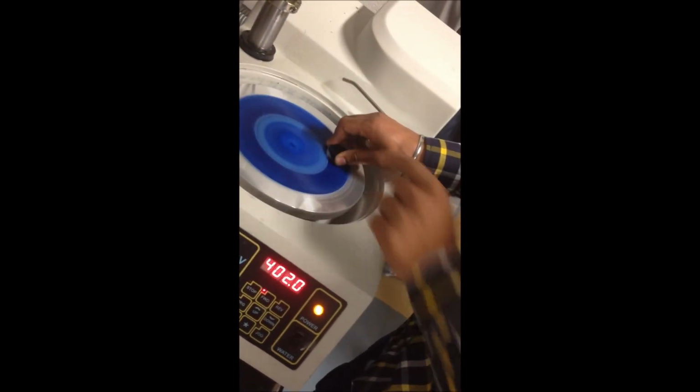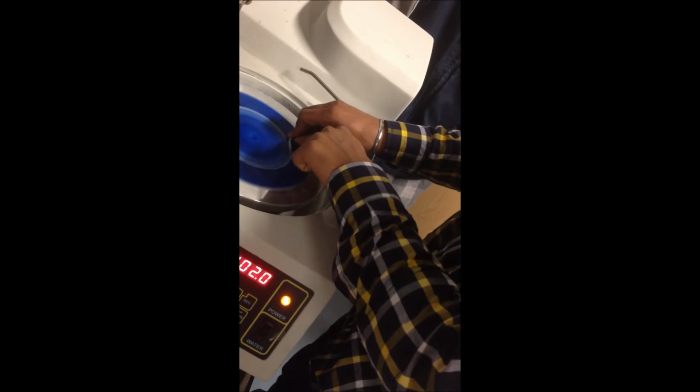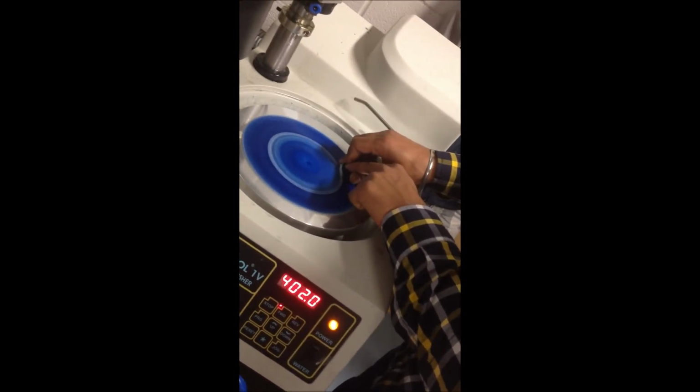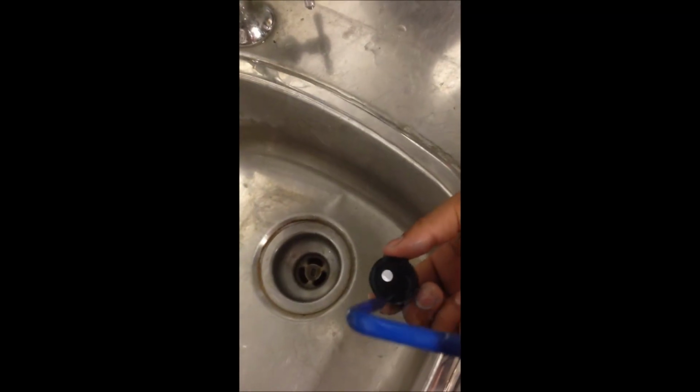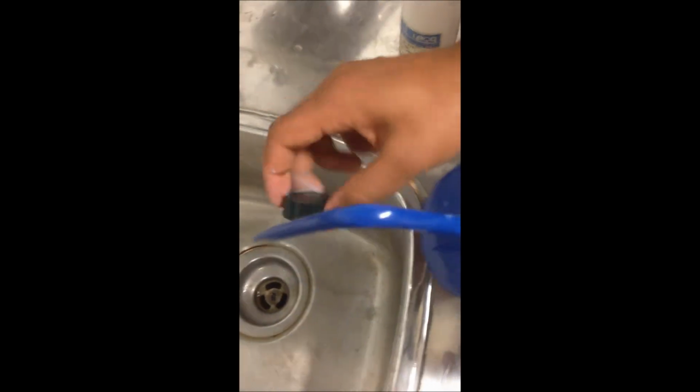This process cleans the material very well. While polishing, we put some polishing powder and distilled water, and we polish the material to get rid of all scratches. When all scratches are removed, we clean the material with distilled water and dry it with clean paper.